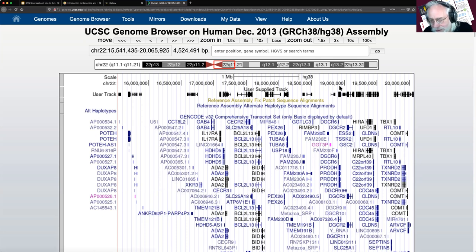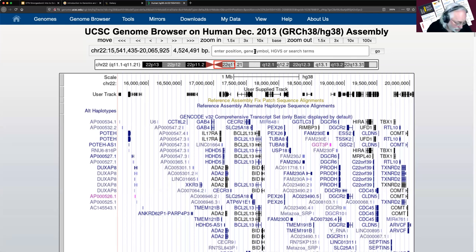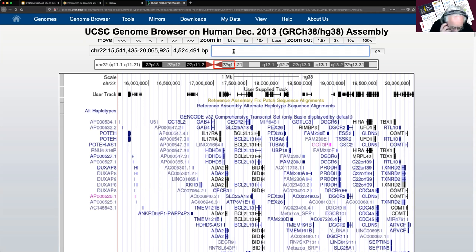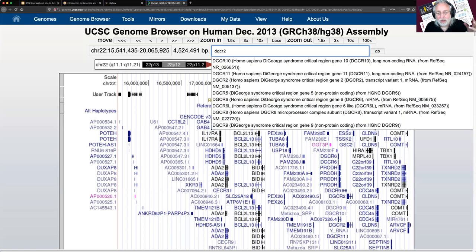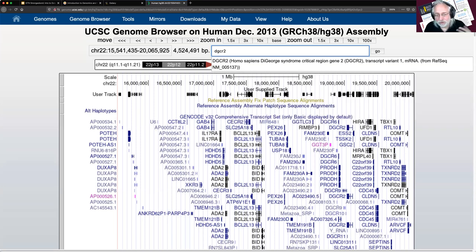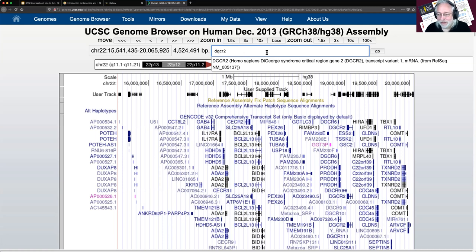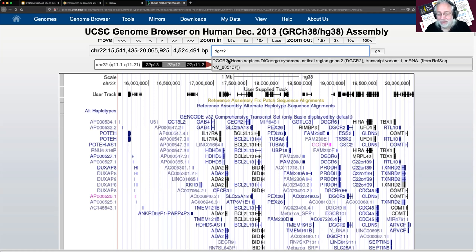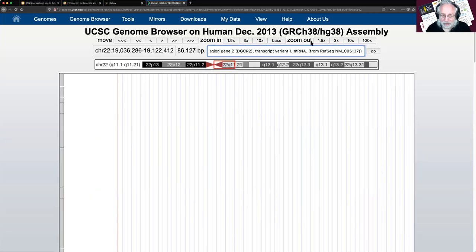I looked at these results ahead of time and found a clear example: DGCR2, the same gene that's in the tutorial. I type DGCR2 into the search, click on it, and it takes me right to that gene. I zoom out by 1.5x to show DGCR2 in its three variations, and I can see from the arrows that DGCR2 is on the reverse strand. There are thick and thin boxes in the display — let's look more closely.